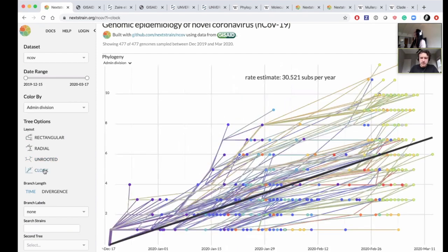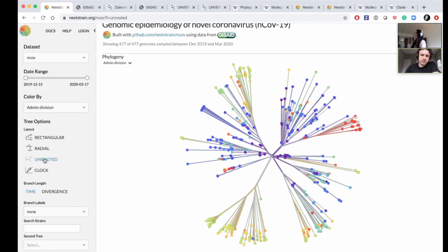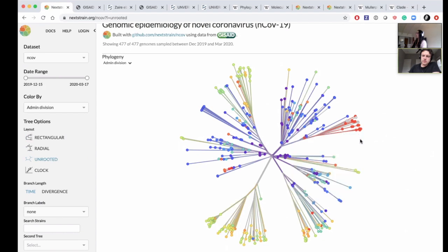Okay, I was going to ask a question, but based on what you said, let me ask it anyways. My understanding just now was that some of the dots overlap because, like you said, they were very similar or the same. Whereas with the Washington ones, there seem to be some distinct branches, and so they might be more similar.